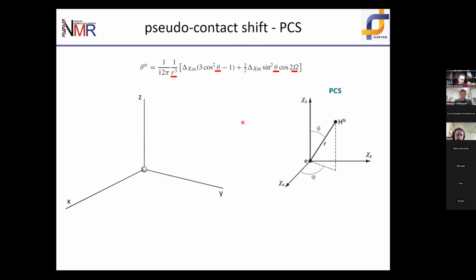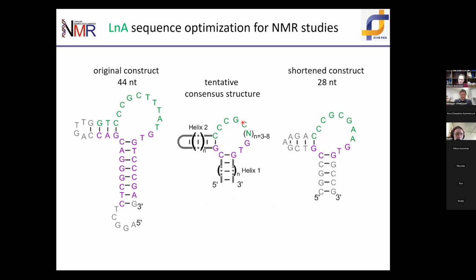You are probably referring to this slide here, right? Yes. Okay. So the main thing that makes this DNA molecule an aptamer is not its structure. What makes it an aptamer is the ability to bind lanthanide ions. So what we were monitoring during this process is whether the binding of lanthanide ions is affected or not. If we made a change and suddenly the binding constant was worse, we knew we messed up something in the structure and could not use this construct. However, this construct that we got has a metal binding constant even slightly better than the original. So we know that we didn't mess up anything important in the structure, because the function is preserved, and what defines an aptamer is its function. Okay, thank you.